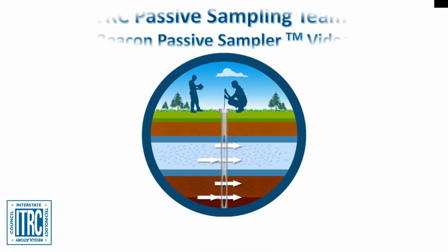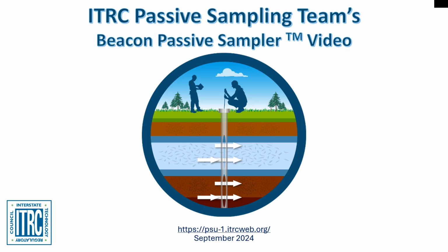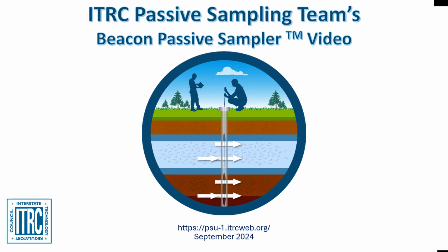Welcome. The Passive Sampling Technology Update team is proud to present an overview of the Beacon Passive Sampler technology. This quick video will provide a high-level overview of the device, as well as instructions on how to use, deploy, and retrieve the device. For more information on this and other passive sampling technologies, please visit the Passive Sampling Technology Update Guidance document.